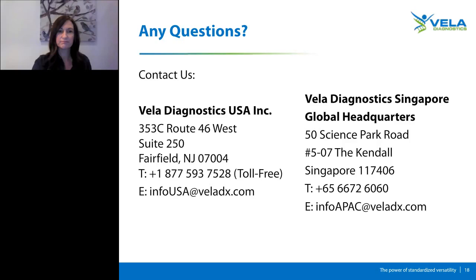Let's see, we've got lots of great questions coming in. Lou, an audience member submits a question: if I'm not mistaken, you said about 4 to 5% sensitivity in mutation detection against WT background. Isn't it too low for liquid biopsy?